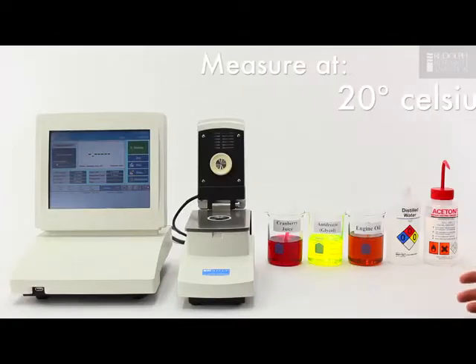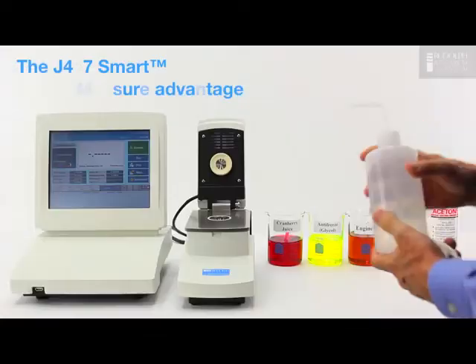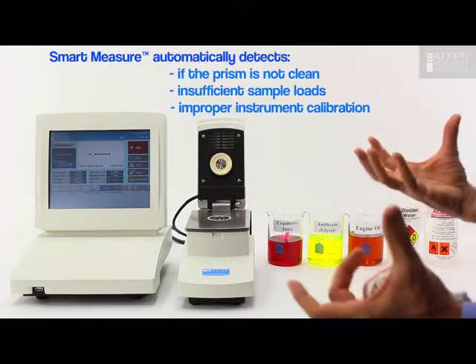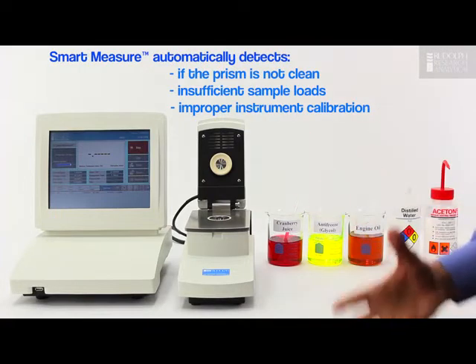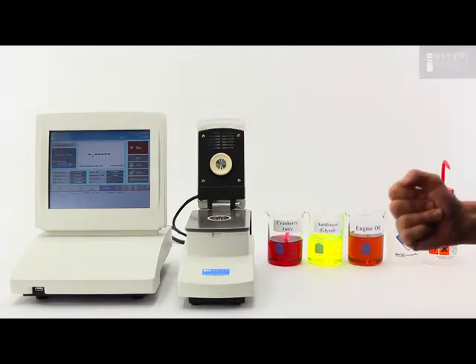I'm going to start by measuring all these samples at 20 degrees Celsius. The first sample I'll do is distilled water. I place the sample on the prism. I have the smart measure setting to auto start. The instrument detects that the sample is there and starts to bring it to 20 degrees Celsius. I've got it set to delay 30 seconds to make sure it's exactly at 20 degrees. When that delay time is up it will then read and display the results on the screen.